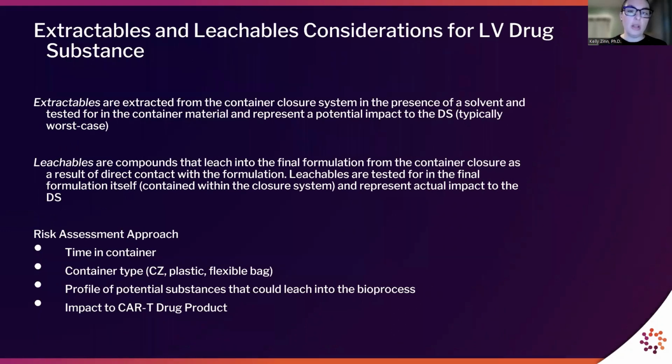As we're talking about manufacturing and formulation, another consideration for the overall development and characterization of a lentiviral vector drug substance is extractables and leachables. Extractables are extracted from the container closure system in the presence of solvent, and they're tested for in the container material.